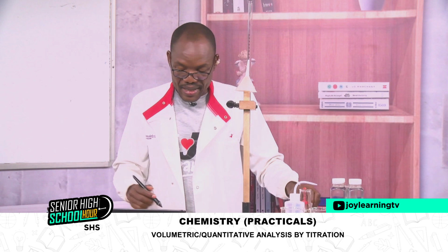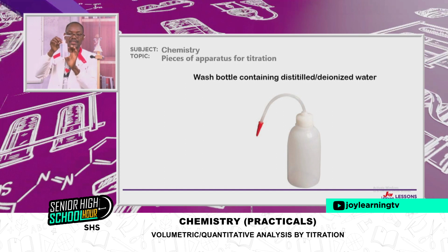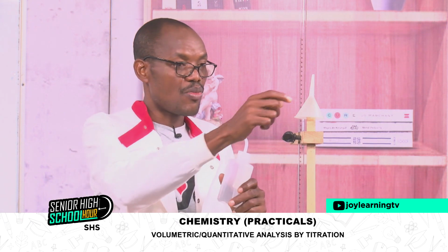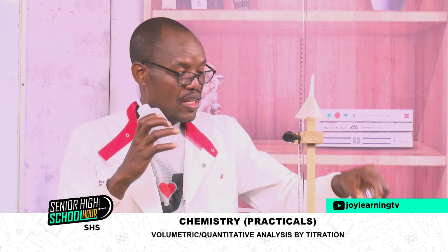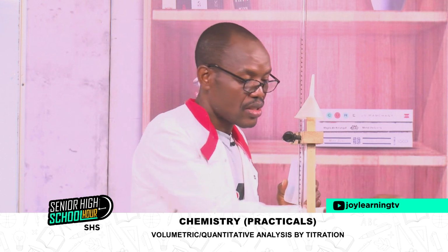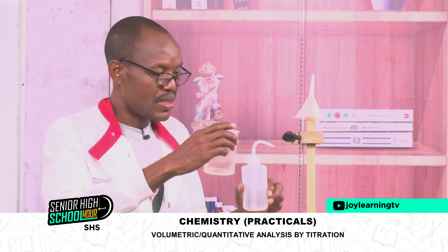Next on our list, as you can see on the screen, is the wash bottle. The wash bottle contains distilled water or deionized water. This one, you use it in rinsing. You want to rinse your burette, you want to rinse your pipette, you want to rinse your conical flask. Whatever you want to rinse, this one helps you. It has a spout that directs the solution directly to where you want it to be. Then you rinse.